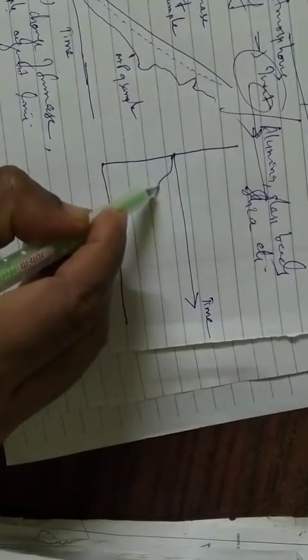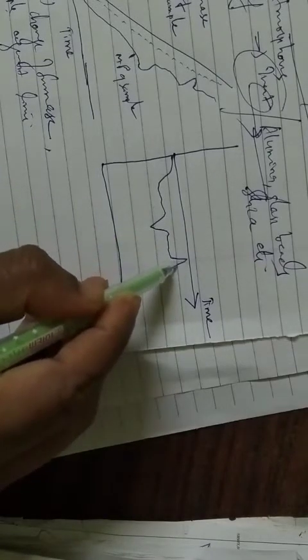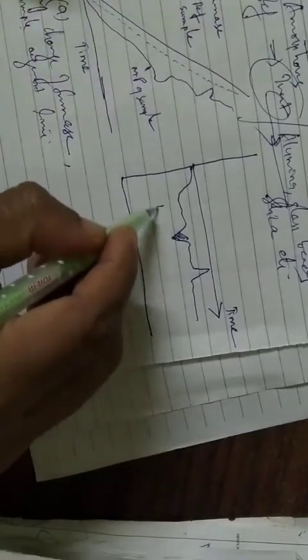Now if you differentiate this, I can take another graph here like this, because it is a differential thermal analyzer. Now this is the regular one. If I go for the differential, I take time here, and I may get something like this. This is how we get it, and this downward part is the melting of the sample, which we call endothermic.